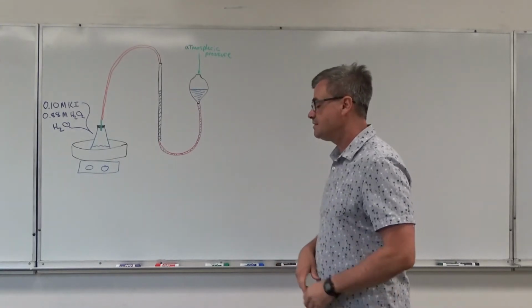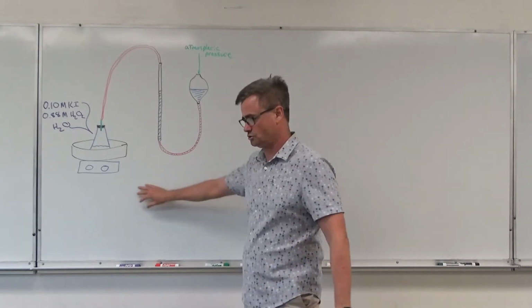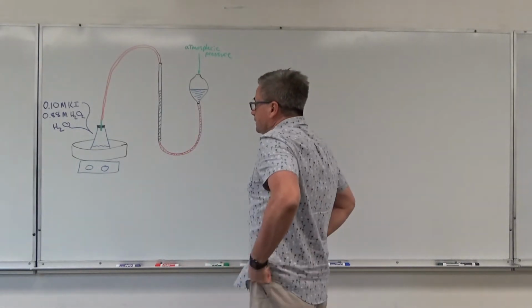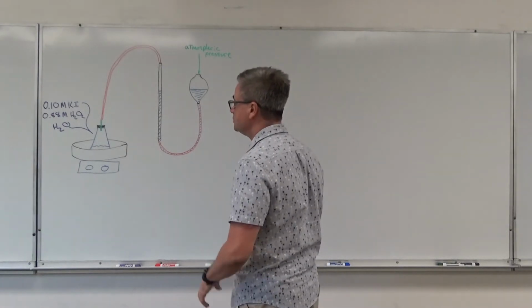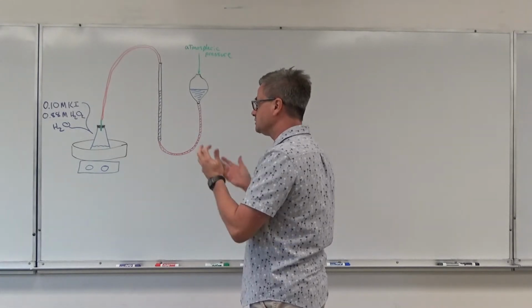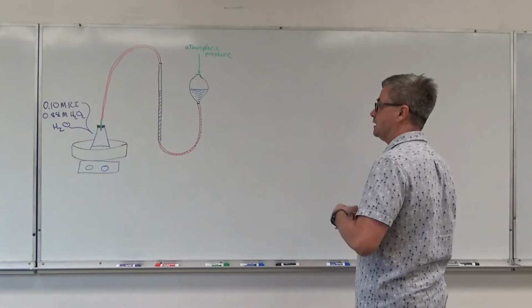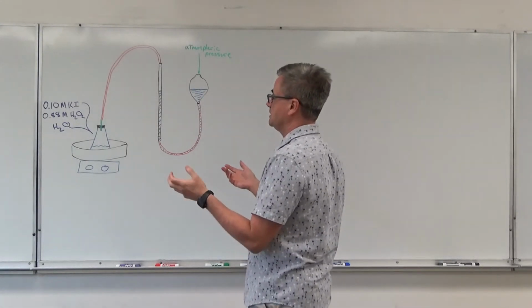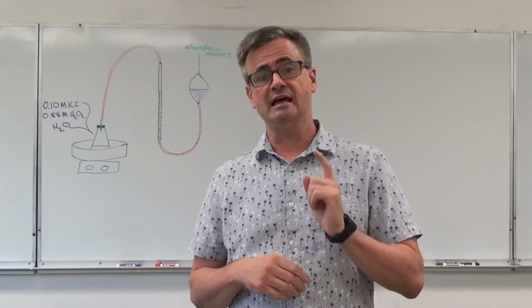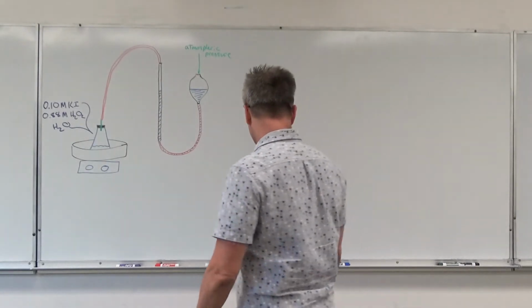All right. Then let's say 30 seconds goes by, and I'm going to chart this out in a second for you. We know that some of those molecules of hydrogen peroxide have been consumed. How are we going to figure out how many moles of hydrogen peroxide have been consumed? By determining how many moles of oxygen have been produced. Now, how the heck are we going to do that? It's a very clever setup. I like this experiment a lot.